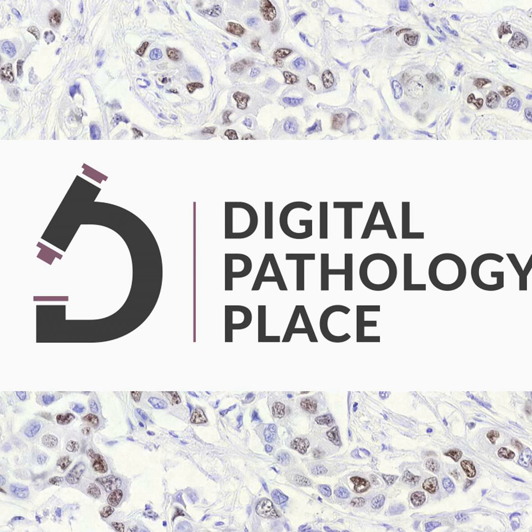So as we said before, we're probably going to be looking for segmentation assistance. We want something to help us delineate the edges of every single cell so we know which biomarkers are inside of those cells or are upregulated in those cells. And then we're going to want some AI to help us automatically phenotype, because as our plex gets higher and higher, we don't want to set the rules for the phenotyping.